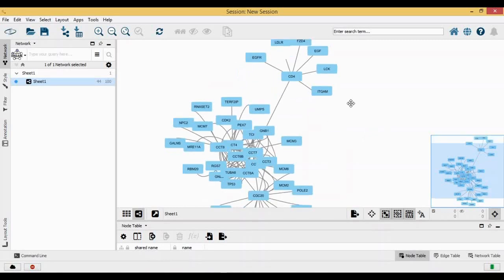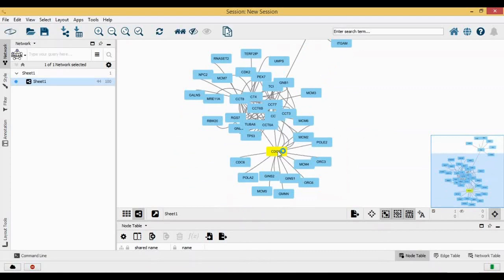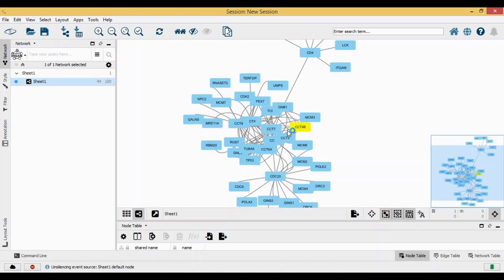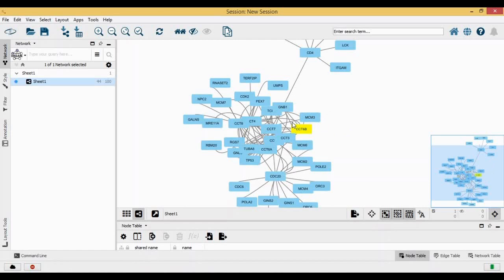You can actually see that there is one hub here, and probably somewhere in the middle there is another hub. These are all hubs which are there. Now let's represent this in a very different way.